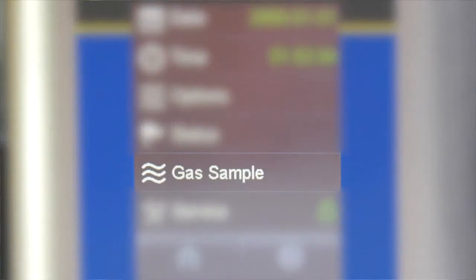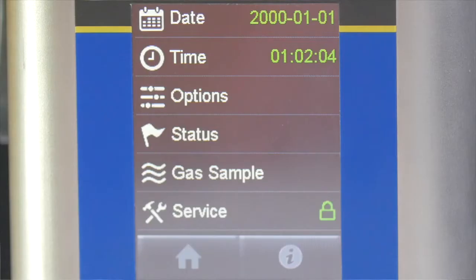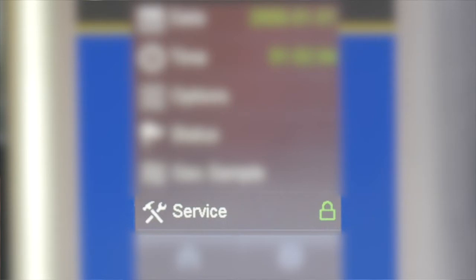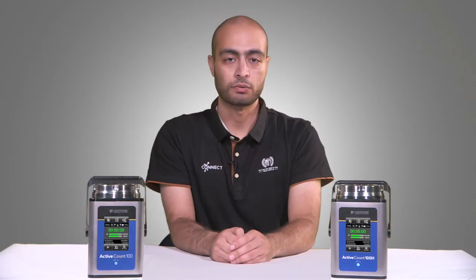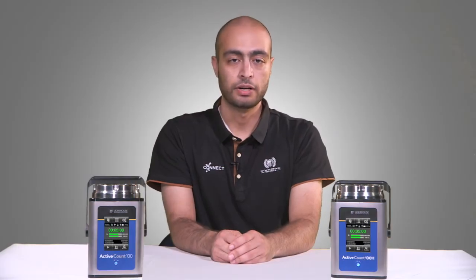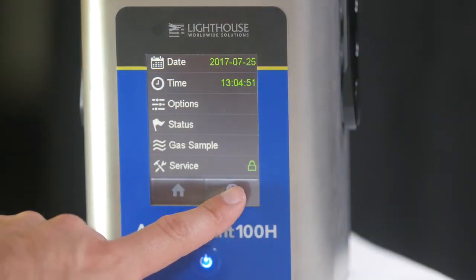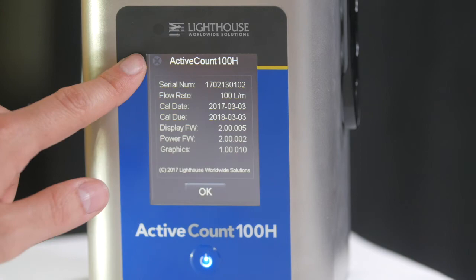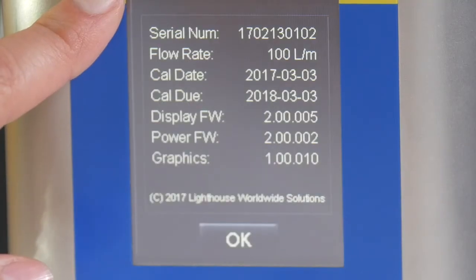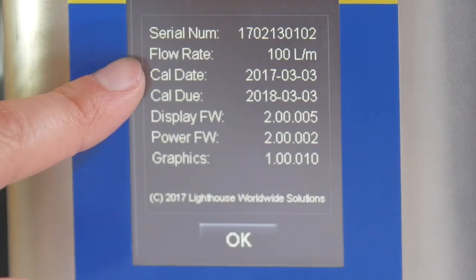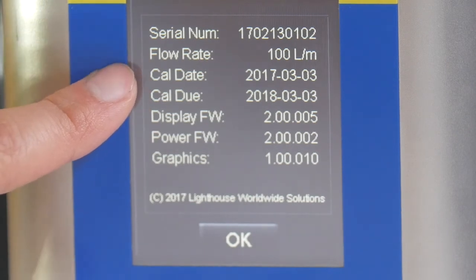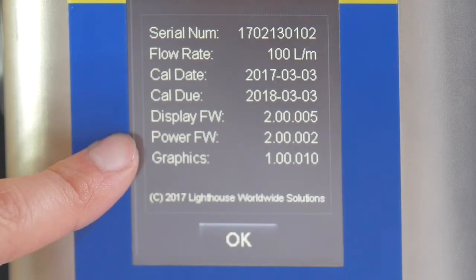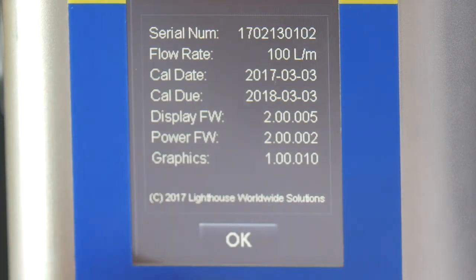Next, we have the gas sampling adjustment. We will cover compressed gas sampling in a separate video. Next, we have service access, which is password protected and is used for instrument calibration. On the bottom of the settings menu, we have an additional button to view instrument information. This information screen includes the model name, serial number, flow rate, calibration dates, and firmware versions. Press OK to return back to the settings menu.